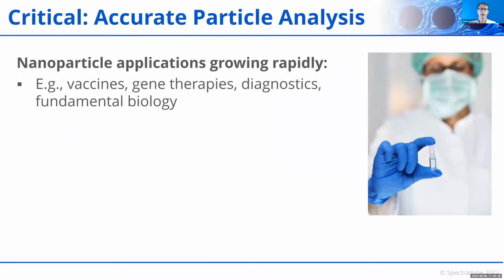Let's get started. Ultimately, we're all here because we're doing some kind of nanoparticle-based science. And as we know, applications of nanoparticles are growing rapidly. Witness, for example, the LNP-based COVID vaccines, new gene therapies, particle-based diagnostics, and regular new discoveries of the important roles nanoparticles play in fundamental biological processes.